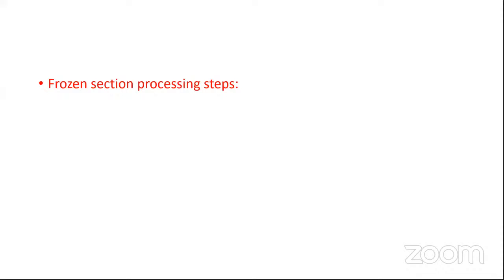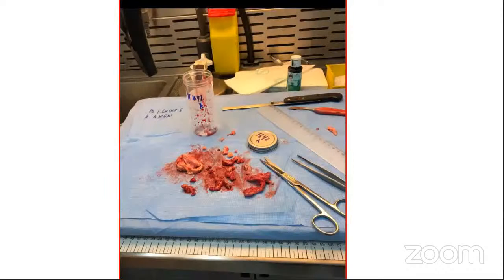Frozen section processing steps. Instead of talking about the steps, I will show you pictures of them. This is a case that came a couple of days ago on Tuesday. This is a 24-year-old female who was newly married and had pelvic pain and was found to have an ovarian cyst.